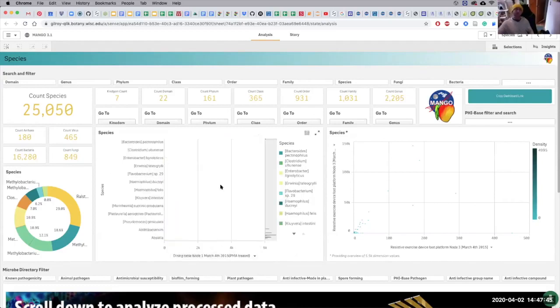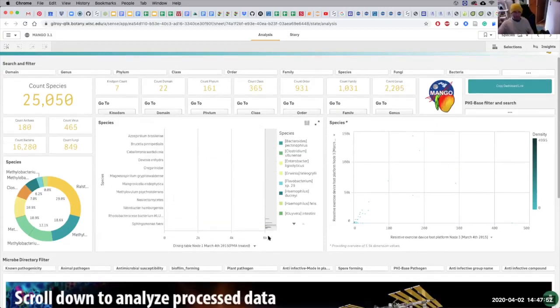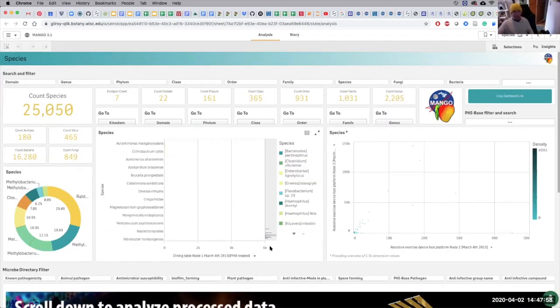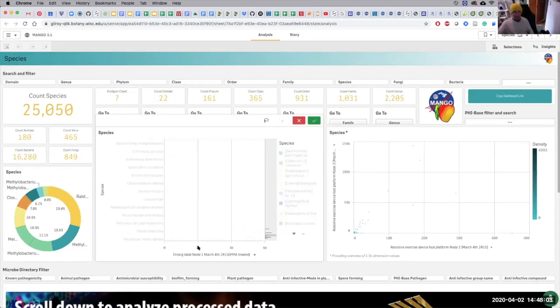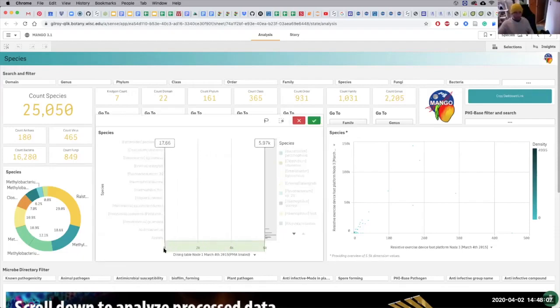Let's use PMA treated. Oh, look, we're down the bottom here. You can see that. There they are. I move up and down a little bit. Because of the way it's done this weird thing, I'm just going to click on that. Oh, no, it's not done right.